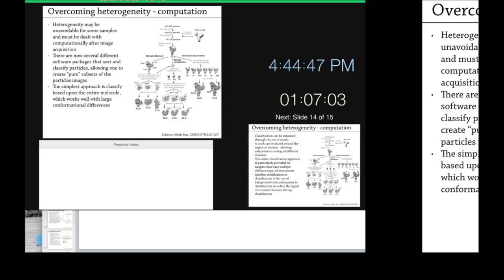Any other questions, comments? Anyone else have a different experience with picking? Those bad particles will be removed by 2D, right? Well, that's the thing, what does 2D pick? Does anyone know how the 2D algorithm works? From 2D you will see the good particles and bad particles, right? Well, what is your idea of a good particle?